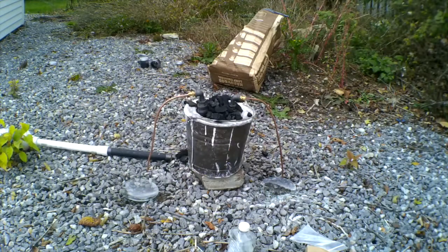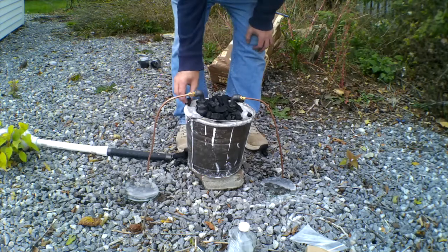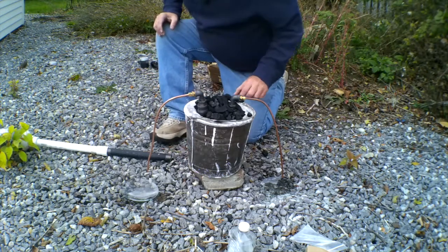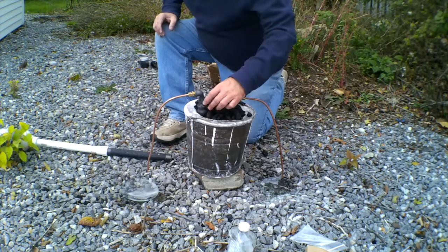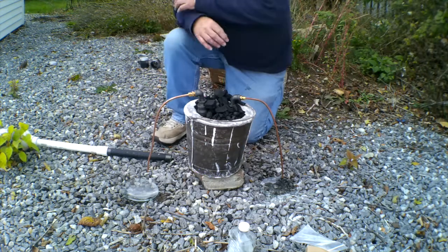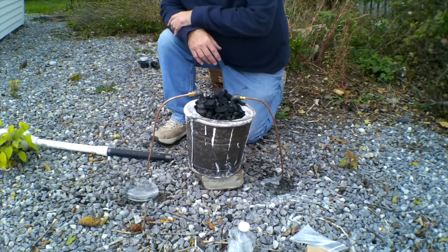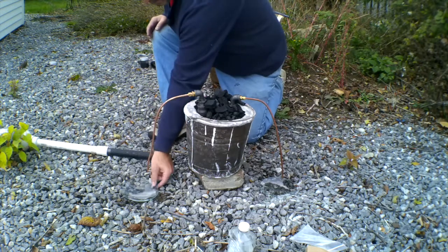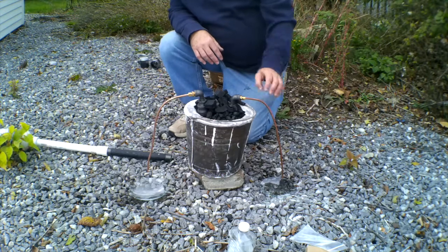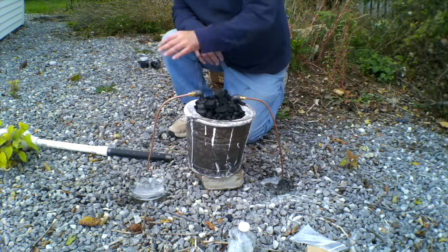So here's my experimental setup, as it were. This is the white potash, this is the brown potash. I've got to kick this thing up pretty hot to have any chance of pushing this thing to actually react. I'm not sure how hot I have to get, but maybe 1200 to 1500 degrees C. The weak point of my setup are these pieces of brass, because they're going to melt at 900 C, and I can easily achieve that. I've done it before. Potassium's boiling point is 750 C, so I don't have to break 900 to get the potassium to get through this elbow and into the condenser. You guys might remember from the zinc video that most of the condensation actually occurred in the elbow. It didn't actually go into the condenser.